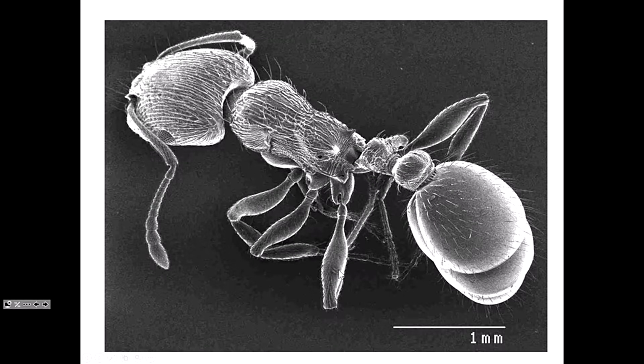So we can see very, very fine detail of the surface of the ant. We can appreciate the detail of that ant now much more so than if we were looking at a cross-section through it. We wouldn't really get the same appreciation of the various structures.